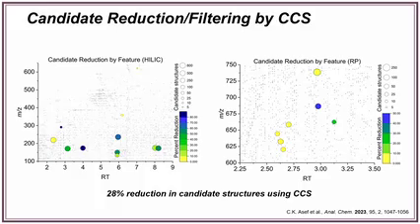Now, the other benefit that I mentioned for adding the ion mobility is this candidate reduction and filtering process. In this particular example, this was data that was collected in Facundo Fernandez's group, and they did the same experiment on an Orbitrap setup and a Waters Synapt traveling wave instrument, so the same chromatography, same samples. They had tandem MS data from the Orbitrap system that they used with Sirius 4 to get some potential identifications for 19 of these features that were in their data set.